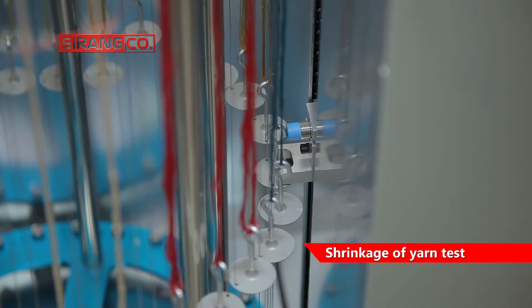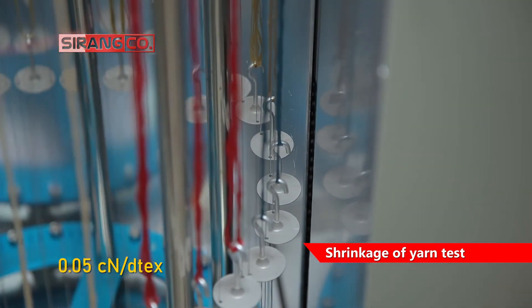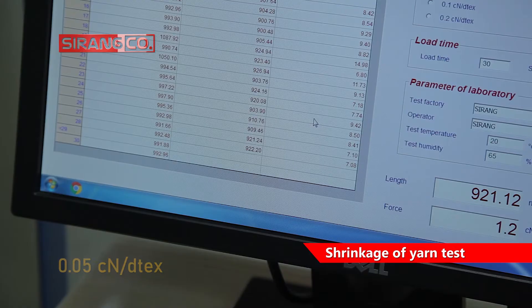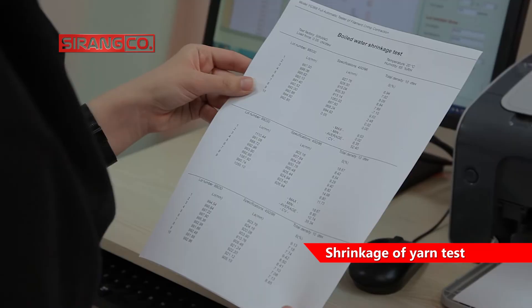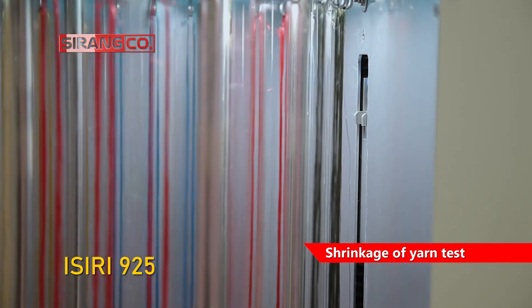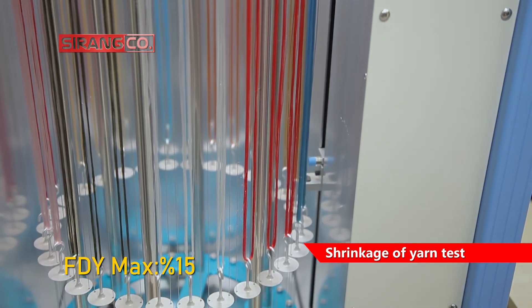It is noteworthy that the applied stress for this yarn is set at 0.05 cN per dtex. Yarn shrinkage is calculated by the machine software as a percentage using the primary and secondary lengths. According to Iranian National Standard No. 925, the maximum shrinkage percentage of FDY yarn is 15%.